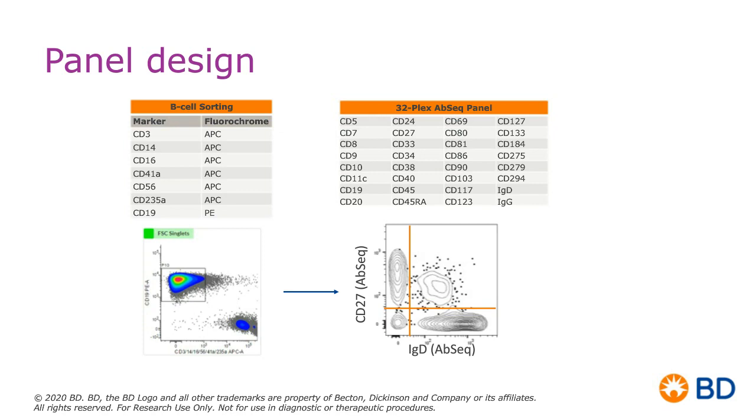It allows us to exclude cells that aren't of interest and can also save time in terms of the number of cells that you need to load into your cartridge system, but it also allows you to effectively add more cells to your analysis. So CD19, of course, there's probably a lot of those cells that are present, but imagine if you're looking at something like a T follicular helper cell.